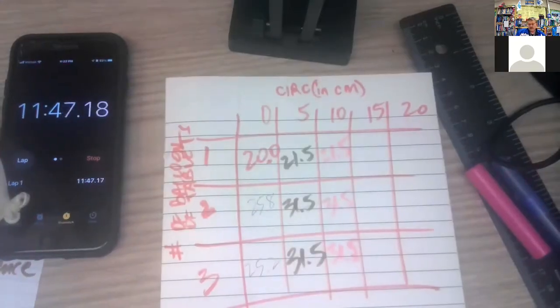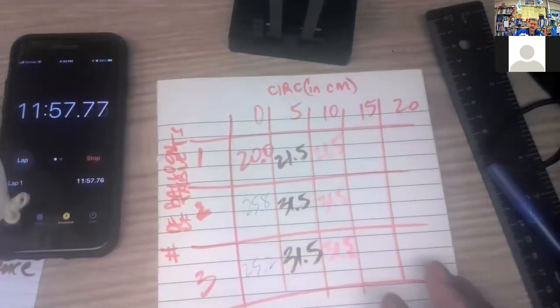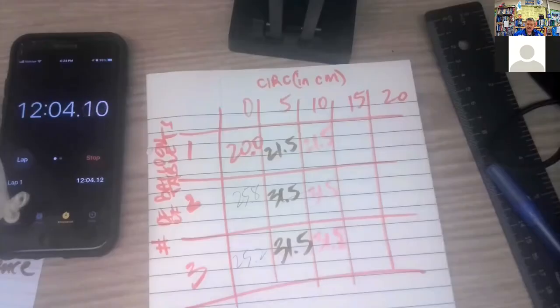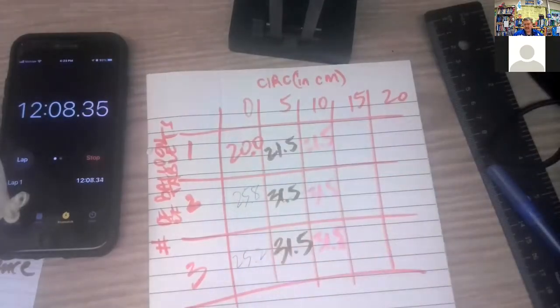So I wonder if I can try it one more time with number 3. While we're doing that, I'll still do the 15 measurement and see if we get the same numbers at 5 and 10. Looks like it goes pretty quickly and then maxes out at 5 minutes. So I'm going to add to this.